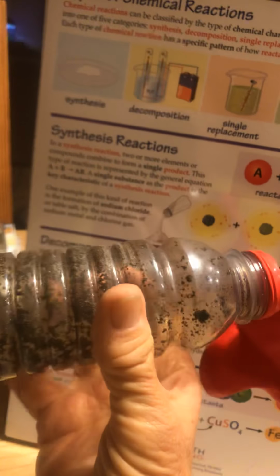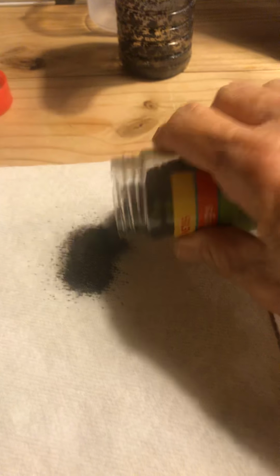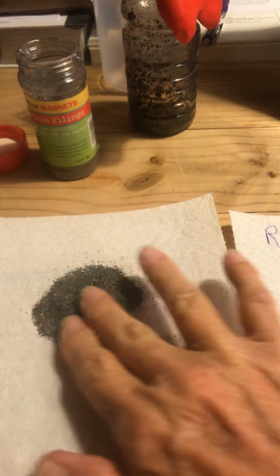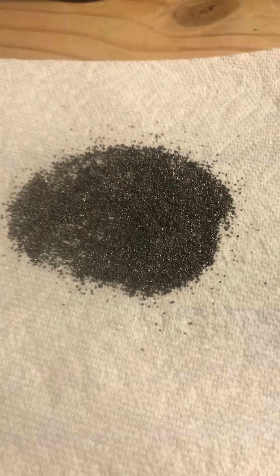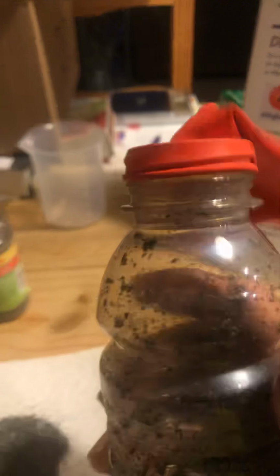Here's the bottle, and you can see that something happened to those iron filings. Now let's take a look at the iron filings. Let me undo the top here real fast. I'm going to pour out some of the iron filings so we can see the difference in it. So there's the iron filings that we put into the bottle yesterday, kind of typical iron filings.